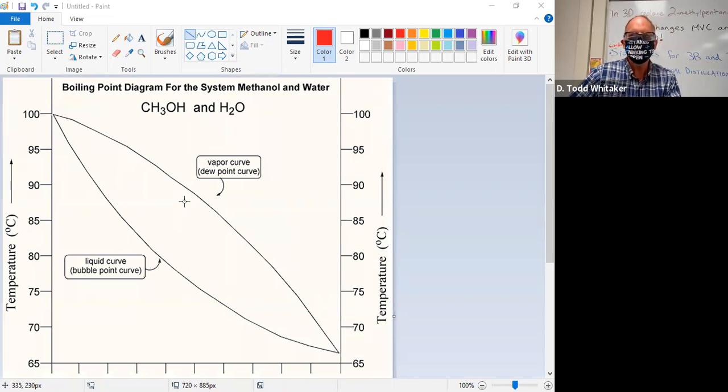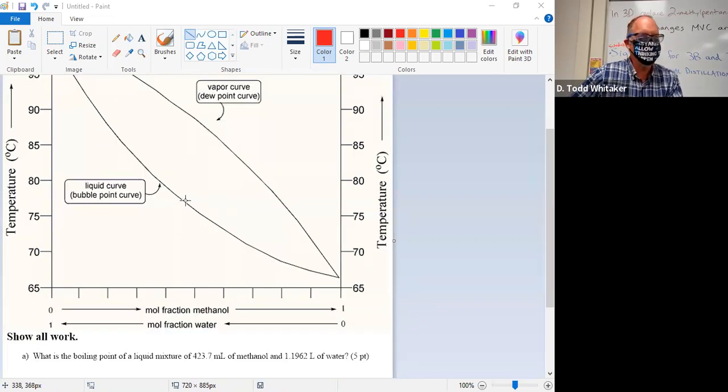When you heat something, the liquid becomes a vapor. And the temperature of the vapor is related to the temperature of the liquid, just like in a mixture of, let's do 2 different phases, water and ice. Game of Thrones reference there. Mixture of water and ice. I can tell you if you throw a thermometer in that mixture, what the temperature is. How can I do that? I know a mixture of water and ice will always have a temperature of 0 degrees Celsius.